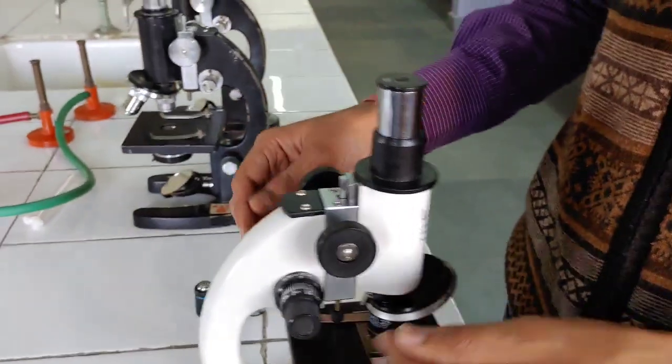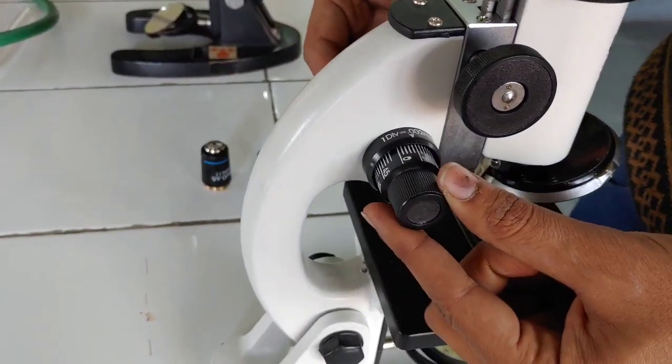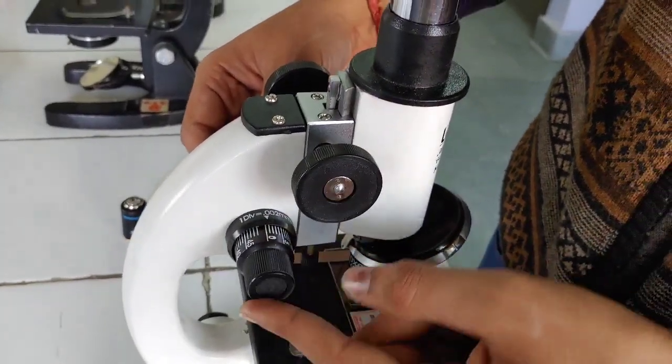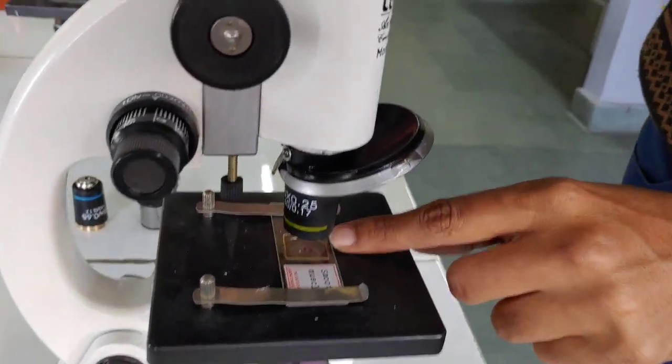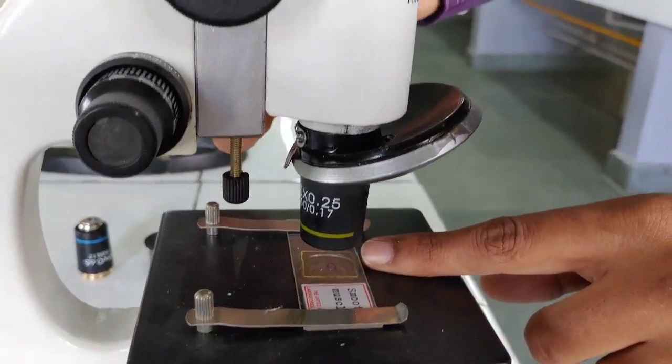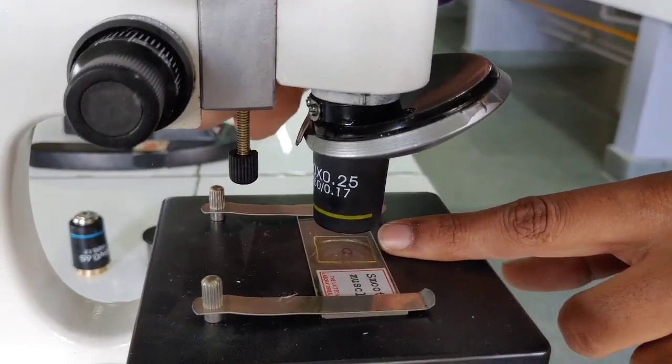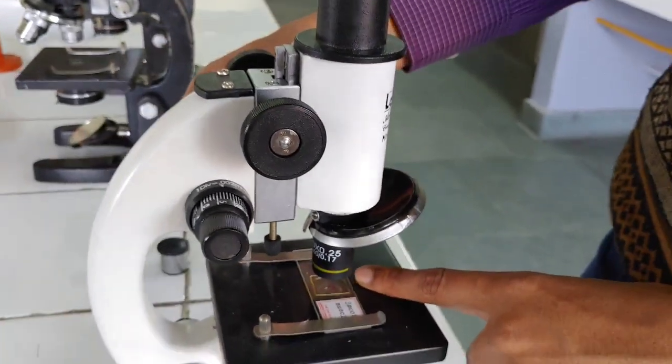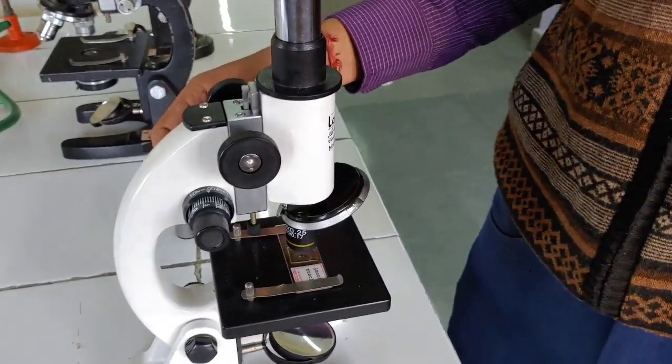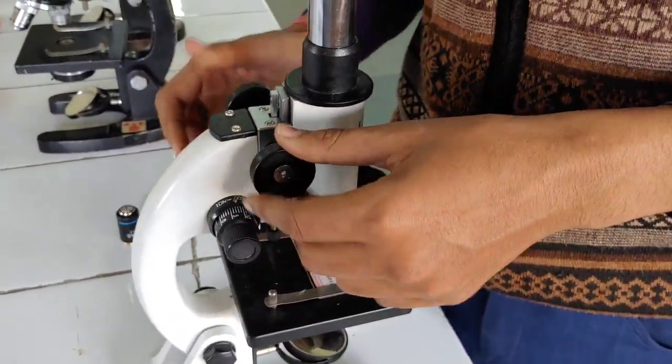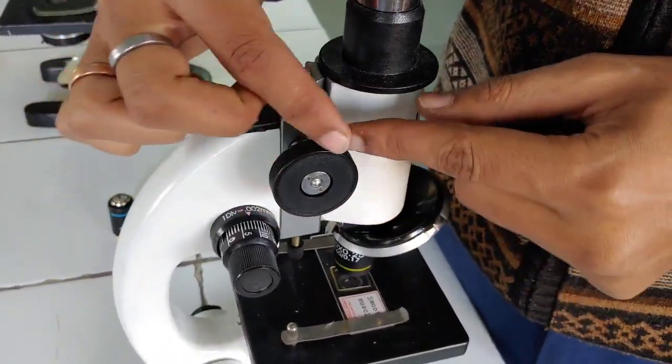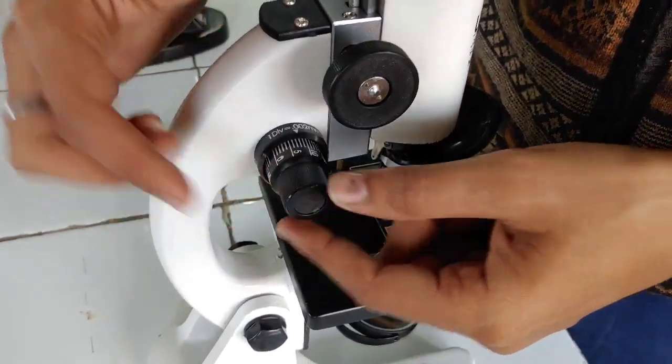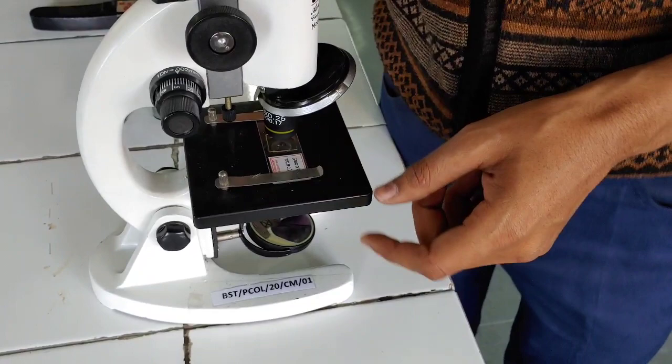Now, next is the fine adjustment knob. What is fine adjustment knob? It is used to bring the same specimen into more focused point, that is the sharp focus. So you have to adjust by yourself which one should be used first. But remember, you should first use coarse adjustment knob and then the fine adjustment knob to focus the specimen more clearly.